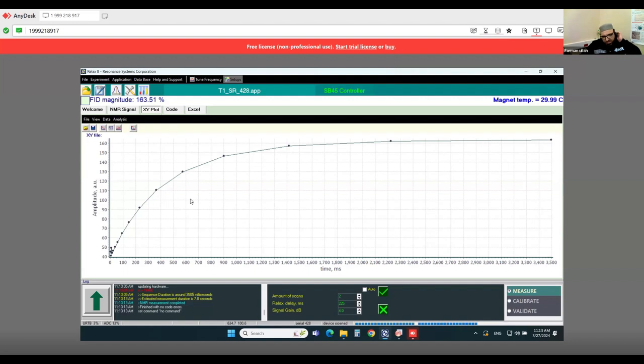Unfortunately, here we see that this software sometimes does not behave, sometimes it has some problem, like loading. This time the same thing occurs here, but I will show this in Origin because we have two options.